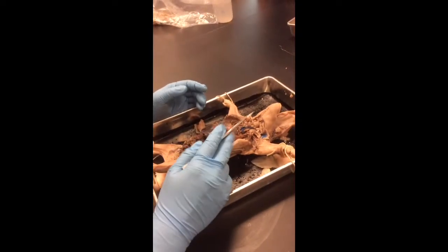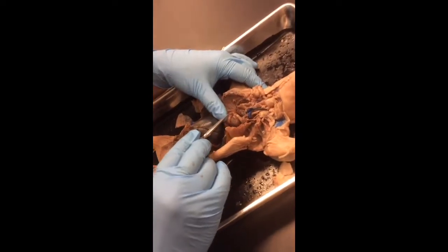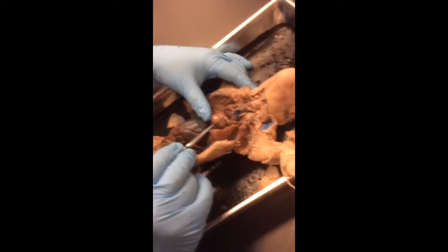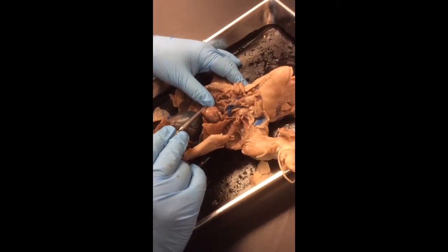Atrium. Do you guys remember how to identify the parts of the heart? These brownish structures on the top are called auricles. Those tell you where the atria are. So right underneath them is the atrium. So there's the right atrium, left atrium. The ventricles are further down. You can't really tell where it divides, so I wouldn't ask that.